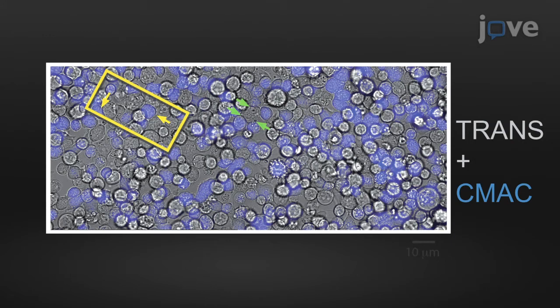Some synaptic conjugates can be seen, including those made up of only one Jurkat cell and several Raji cells, which are complex conjugates. Decreasing cell concentrations will circumvent the formation of complex cellular conjugates, but may not provide enough cell conjugates for the subsequent analysis of polarized traffic, which will in turn decrease chances to find and to image emerging synaptic conjugates.